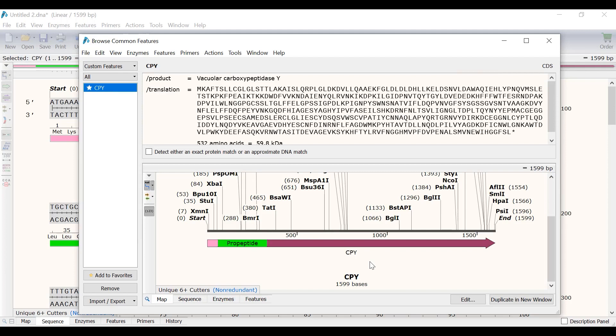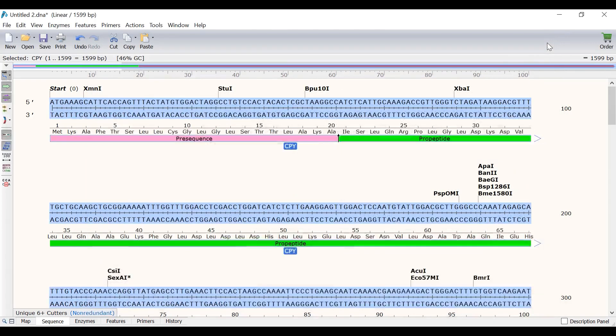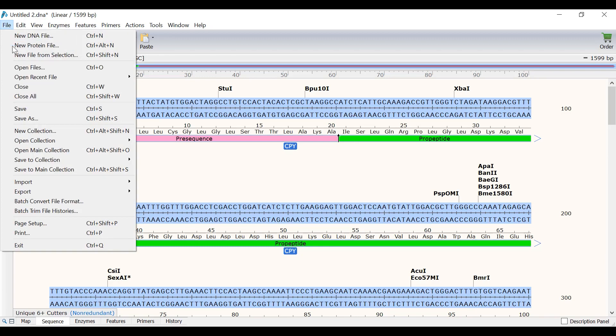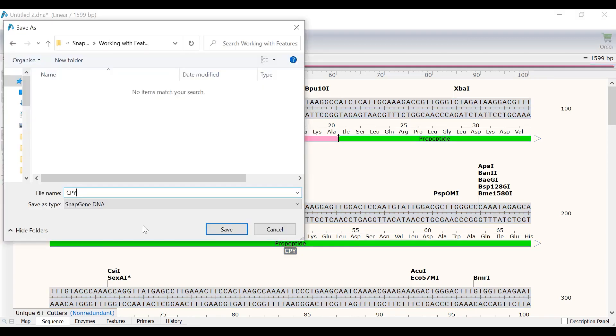Here you can see all the common features that are saved. You can also remove common features by selecting them and pressing Remove. For now, I will just close this window and save the CPY file by going to File, Save and saving the file on my computer.